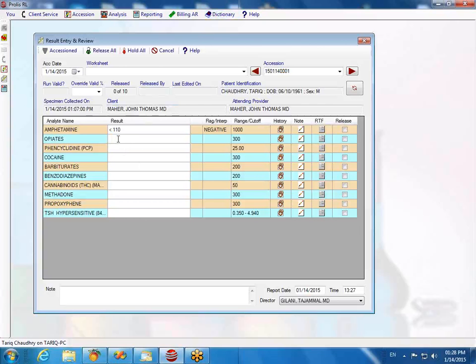Okay. So next I'm going to enter opiates. Let me enter 350. It is positive. PCP is 55. Again positive. Cocaine. Let me enter just 2.